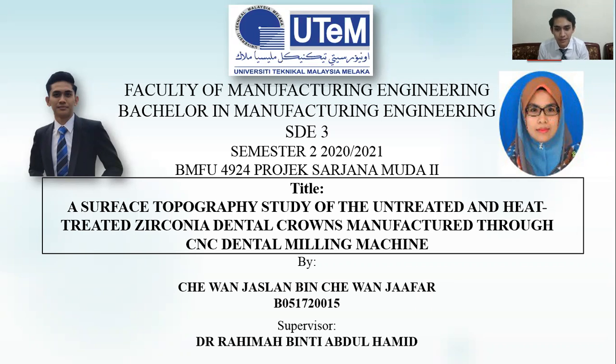My name is Wan Jaslan bin Wan Jaafar. I am supervised by Dr. Rahimah binti Abdul Hamid during my bachelor's degree project. My title for my bachelor's degree project is a surface topography study of the untreated and heat-treated zirconia dental crowns manufactured through CNC dental milling machine.